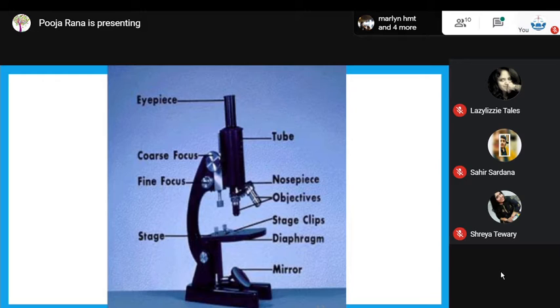So the viewing angle can be adjusted using this particular arm angle, and the frame provides a mounting point for various microscope controls and various panels for focusing light. The large knurled wheel adjusts the coarse focus, and a smaller knurled wheel is there to regulate the fine focus, which is present on the frame. Now the controls for the lamp and the condenser are some other features which are mounted onto the frame. So onto the frame are the major lenses and arrangements made. So it forms the structural component of the microscope.